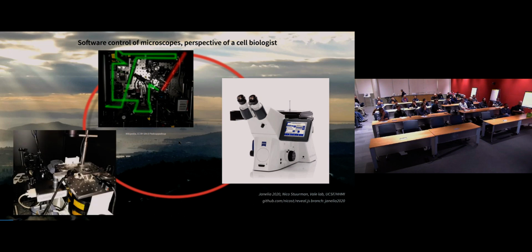And then as a third category, and I see myself and our lab much more there, is the tinkering with systems. So take a commercial system and do something with it that you cannot really do directly with the commercial microscope plus software, but give your lab abilities that extend a bit from the normal, but let you therefore answer interesting questions. And here you're dealing with the exact same problem. It's all software. So I think we're all on one page here. We have need for software control of microscopes.